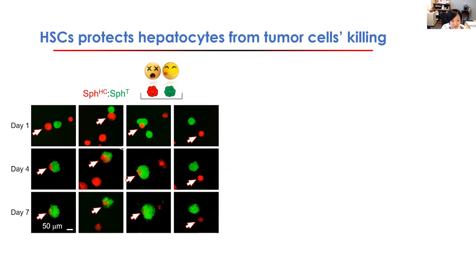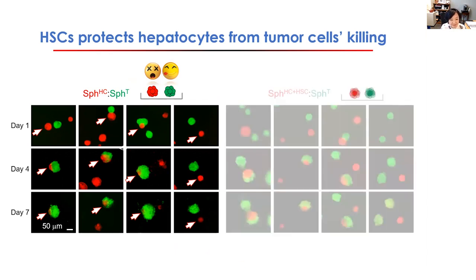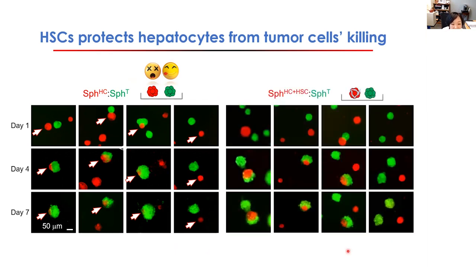And then, with these two outcomes, the hepatocyte was like, okay, no, I'm dying. So tumor cells are happy that they have this food that feeds them. Then what we compared was these spheroids we generated by mixing hepatocytes and stellate cells together, and we put them together with the tumor spheroid, in exactly the same culture condition. Now what we notice is, yes, tumor cells still attack these normal spheroids, move over, get them surrounded and try to swallow them.